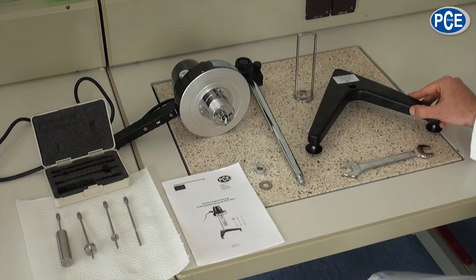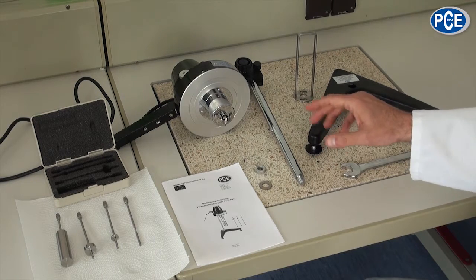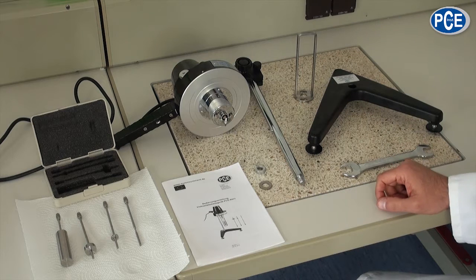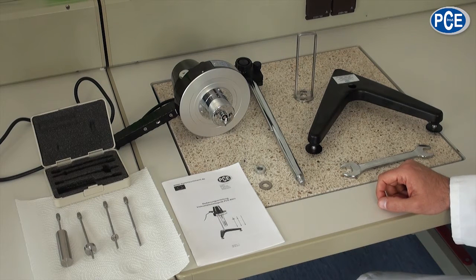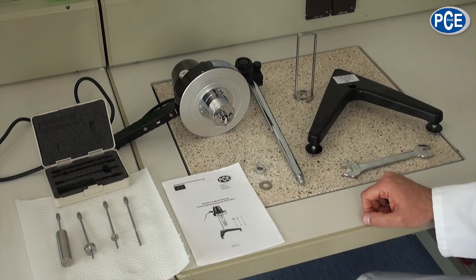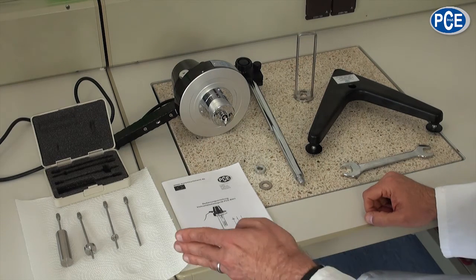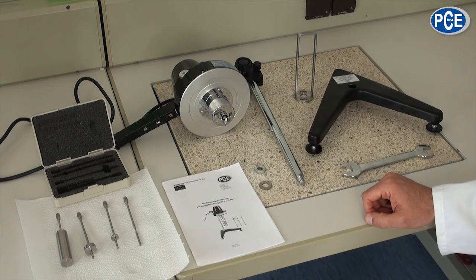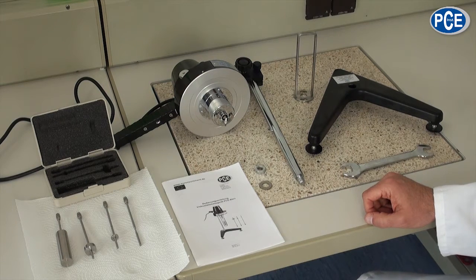In the contents of the PCE RVI1 are a levelable stand, the support rod with the corresponding tools to fit together, a cage for the rotation body, a protection cage, the rotation viscometer and four different rotation bodies in cylinder form and a user manual.